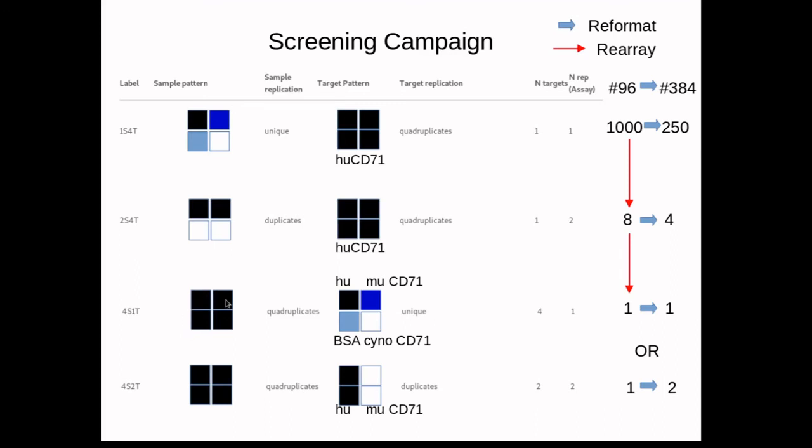If we run our single 96 well plate in quadruplicate on a 384 well plate coated with 4 different antigens, we will get an N of 1. But we could generate replicates by running multiple plates. So if we ran 3 plates in this layout, we'd have triplicates with our triplicates across plates.